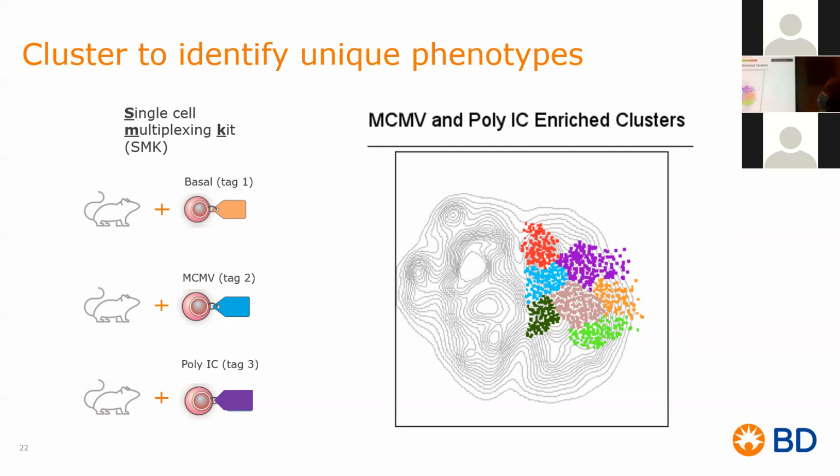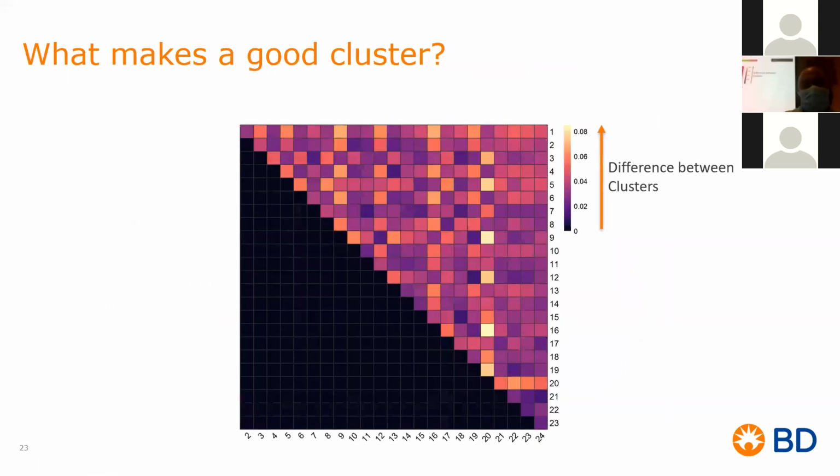But what do we see if we're looking at the global architecture? We see that all the phenotypes that are activated, what do you know? They're all on the right hemisphere of my t-SNE map. So I would recommend that even when you're doing analyses, you're still doing QC. So analysis and QC go hand in hand in multiomics data. Because if it doesn't make sense, there's something wrong.